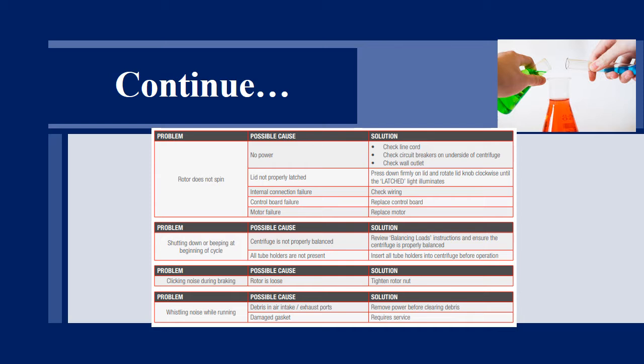The fifth problem we may face in the centrifuge is clicking noise during braking. It can occur due to the rotor being loose, so we have to tighten the rotor nuts. Last problem that can occur in the centrifuge is whistling noise while running. It can be due to the air intake and exhaust ports. We have to remove power before cleaning debris. If there is damage, we may require services for the movement or for the correction of the gasket.